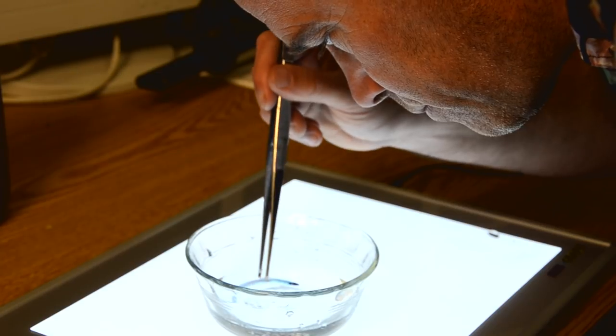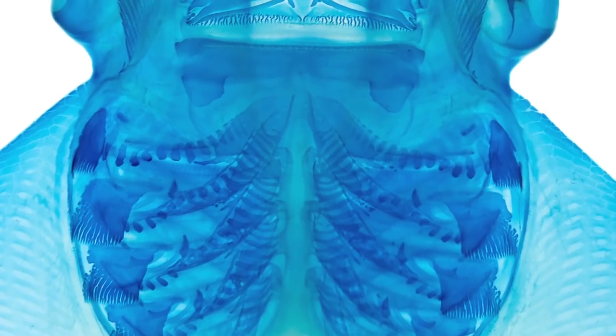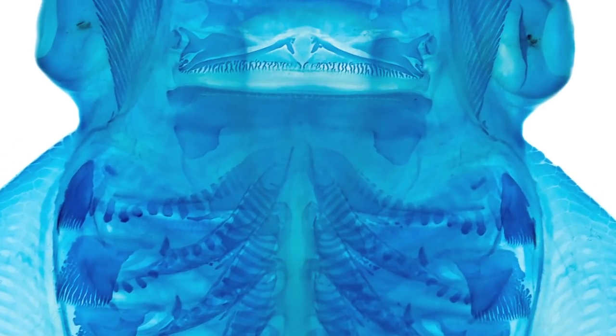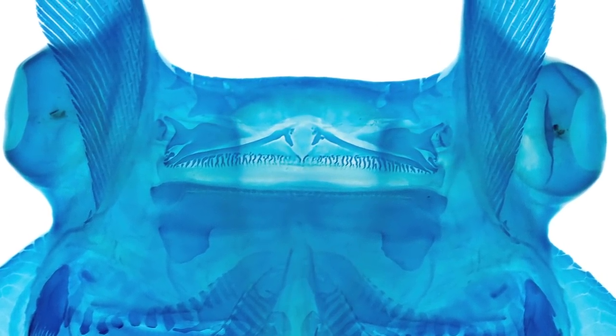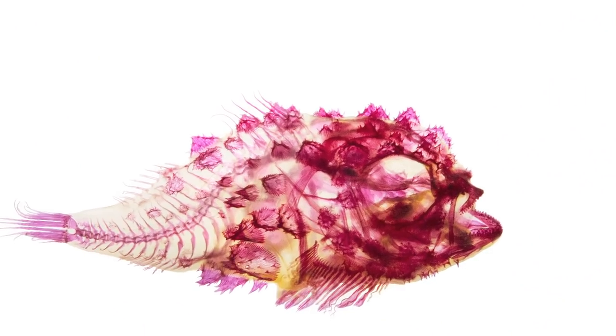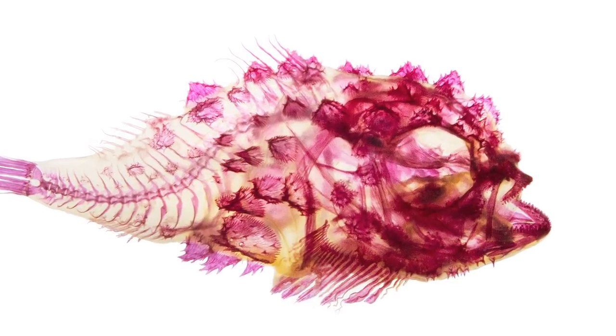It seems obligatory to show some of the prettier results in the hopes that they'll take a look at those fish and go, wow, that's gorgeous. What did we really learn from that? And then realize that this approach to research often leads to completely unexpected discoveries.